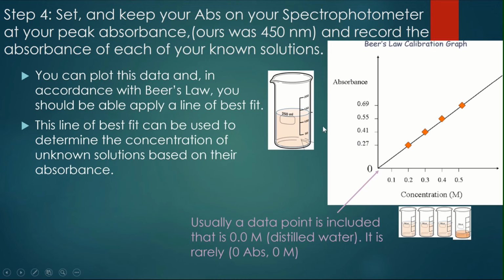It allows us to find an unknown concentration. So here we have an unknown molarity, this orange solution. We know it's going to be somewhere between our known concentrations. We're not sure exactly where. We can fill a cuvette, put it into our machine, find an absorbance. This one looks like the absorbance was at 0.45.